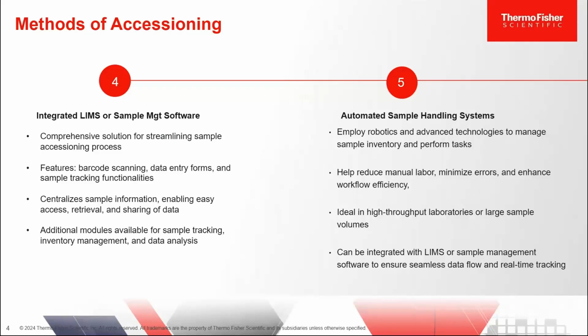And then we have the integrated LIMS, or the sample management software. This is more of a software that integrates with other systems that you may have in your lab, but I wanted to make sure that I call it out because it is integral to all of the automation processes. This software provides a comprehensive solution for streamlining sample accessioning processes, as I just mentioned. These systems offer features like barcode scanning, data entry forms, and sample tracking functionalities.